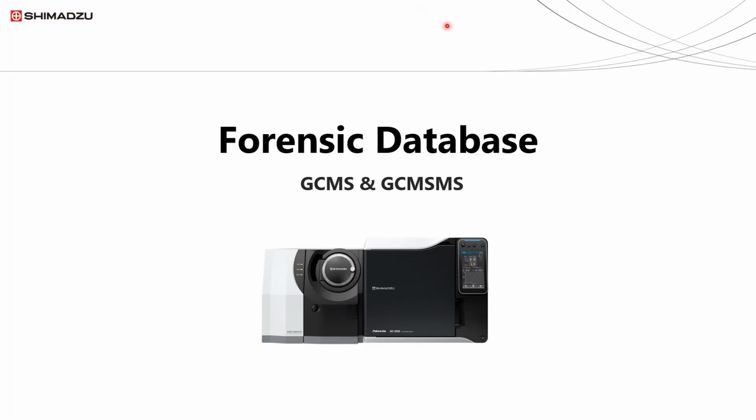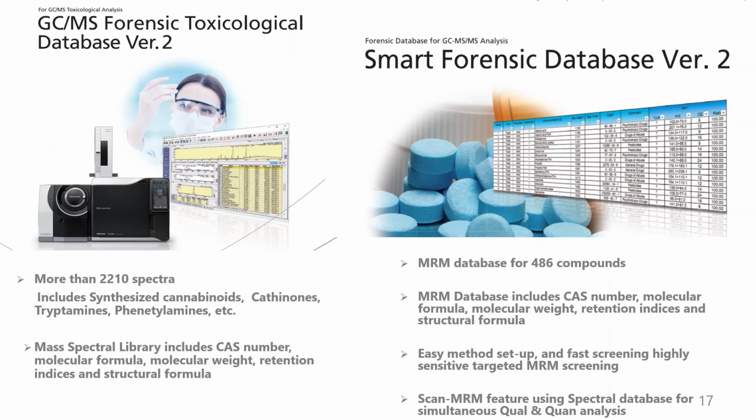Now, I showed you various method packages for LCMS and Q-TOF. Let us now see some databases and method packages for GCMS and GCMS/MS. I'll present today the three different method packages and databases for GCMS and GCMS/MS.